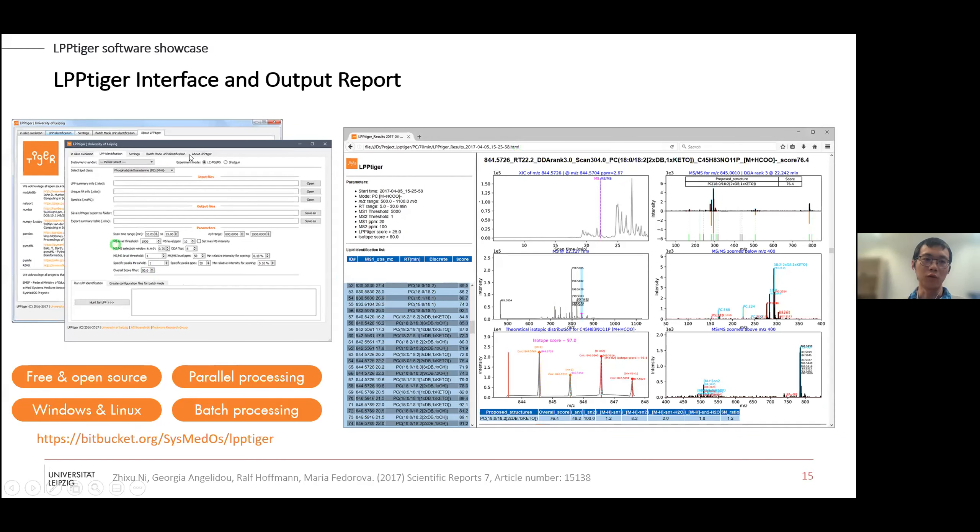This is the software interface. We have a user-friendly software interface, and it's free to download with the link. We also give you a graphic report - you can open the browser to check your identification results. The scores which I showed in previous slides are located here for each identification.